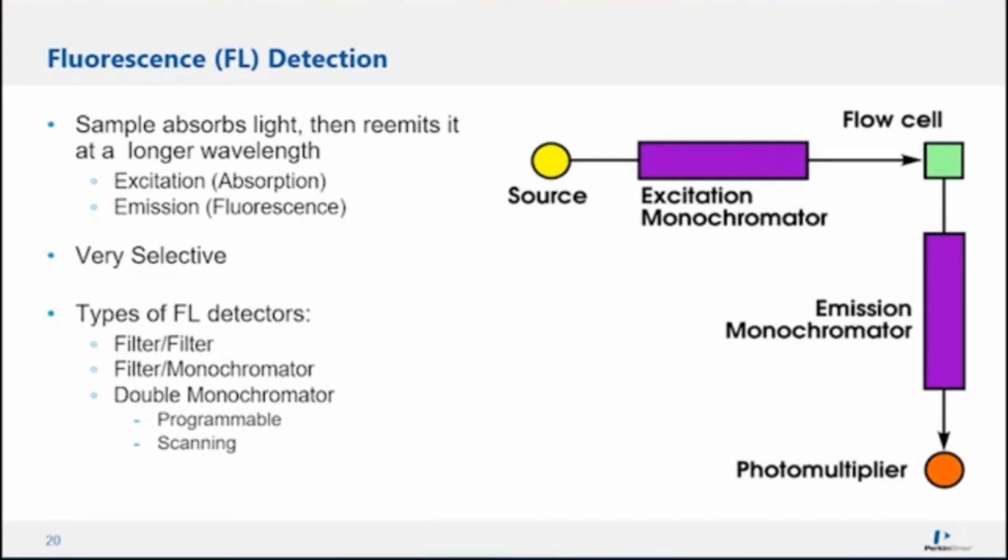This makes this method of detection highly selective because we want to measure the generated light. The detector is not on the optical path of the emission source. This helps to boost the sensitivity of the method when using fluorescence. We always need to specify 2 wavelengths.